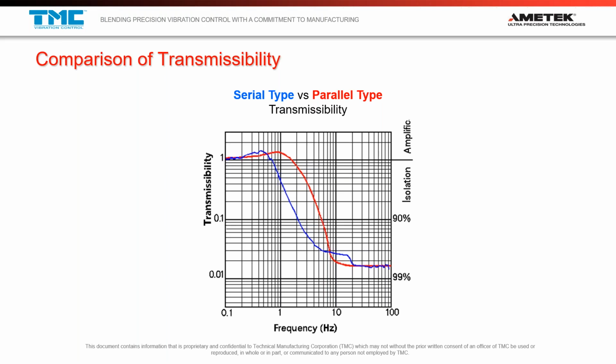So that drift is usually not manifested in most microscope images. You'd have to be going to some very, very specific and very unusual, highly sensitive systems to actually experience that drift. We rarely see it as a problem in microscopy. But the 1 hertz resonance here is close enough to the resonant frequencies of internal isolators that it usually is a problem. And I'll talk about that as we go through some of our examples.